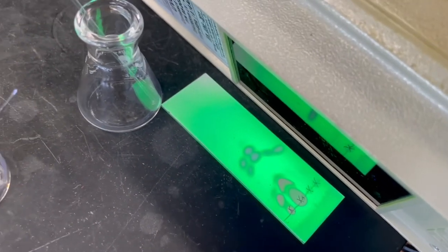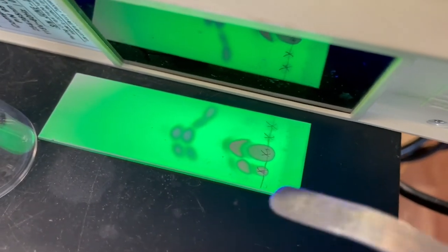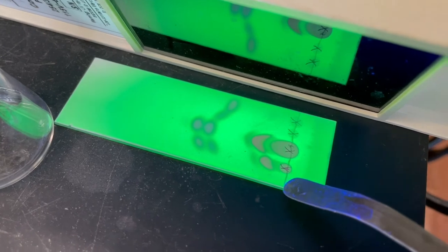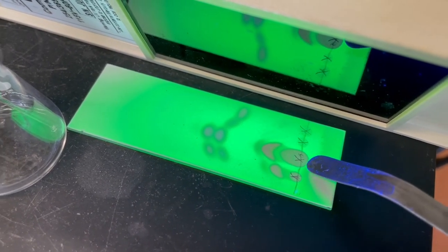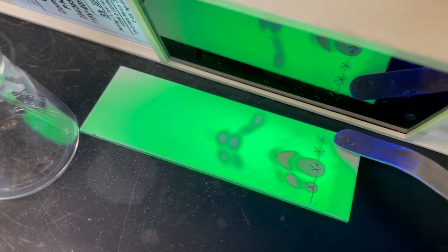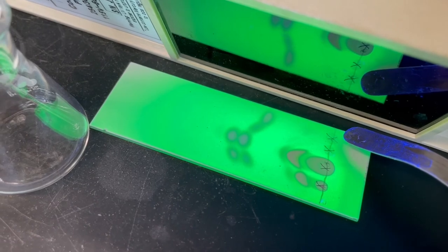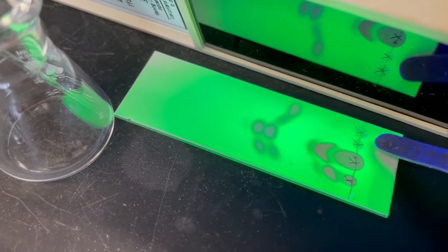So this, let me adjust the angle, okay? Sorry, that's a much better angle. Now what I can do is point with stuff. So this guy right here is the filtrate that was yellow, the filtrate that was orange, the product that was yellow, and then the product that was orange. Or not the product, sorry, the solution was orange, right? So the products for these two were equivalent.